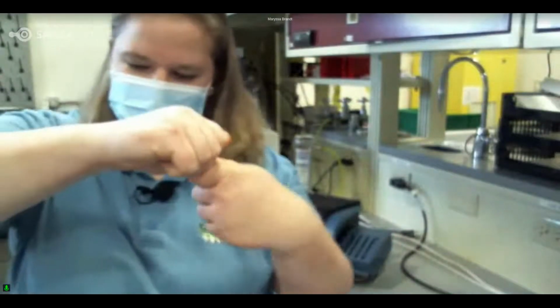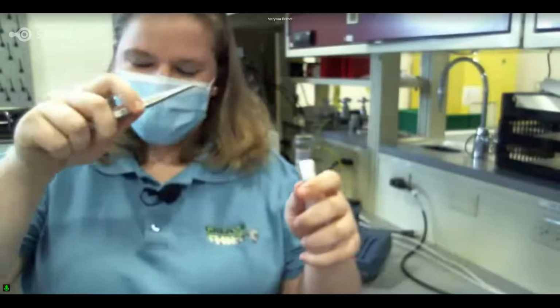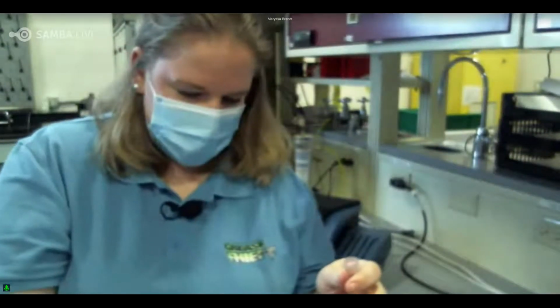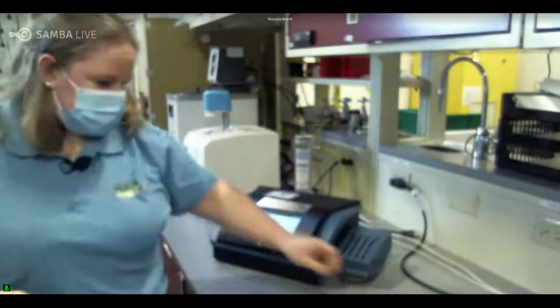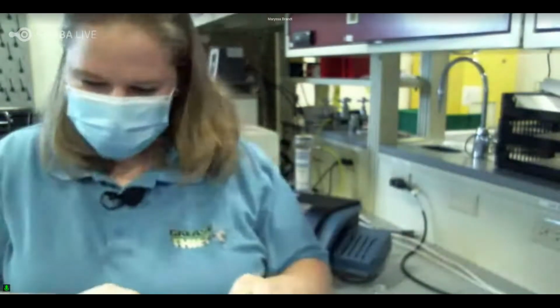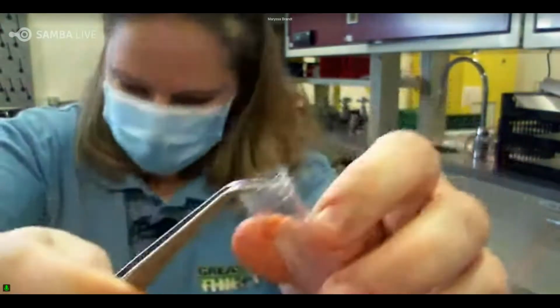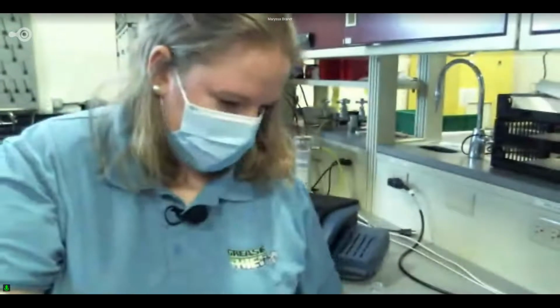So my process is I just take our tweezers, and I'm going to take out a micro cap. I'm also going to need a vial. This is kind of hard to see because they're super small, but I'm going to take out a micro cap using the tweezers.